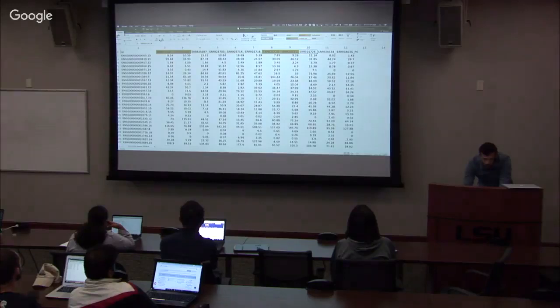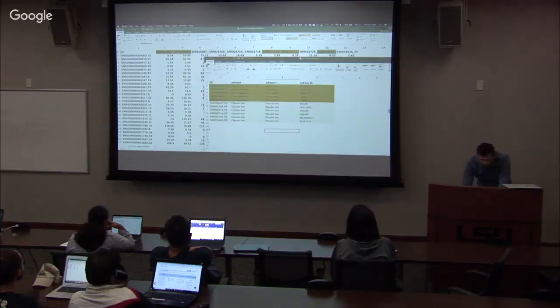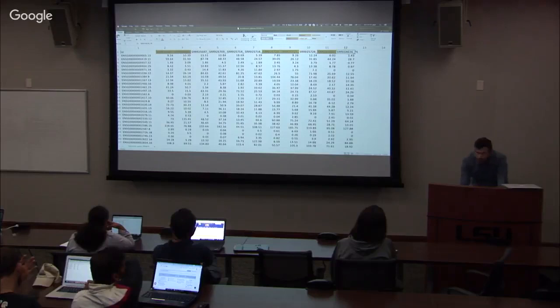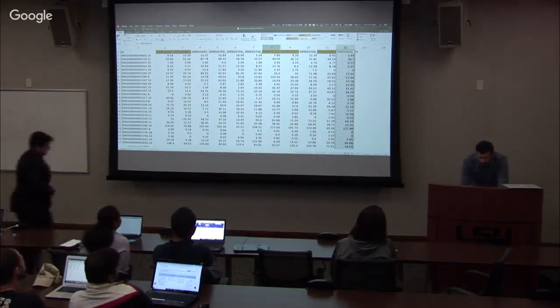So what we're really doing here is creating those groups, because in the end we want to know which file to drag where, so we have to have some kind of reference. And 36 is also claudin-low. Ideally, for my differential gene expression, I would organize them so that they are next to each other, so I can move this around.